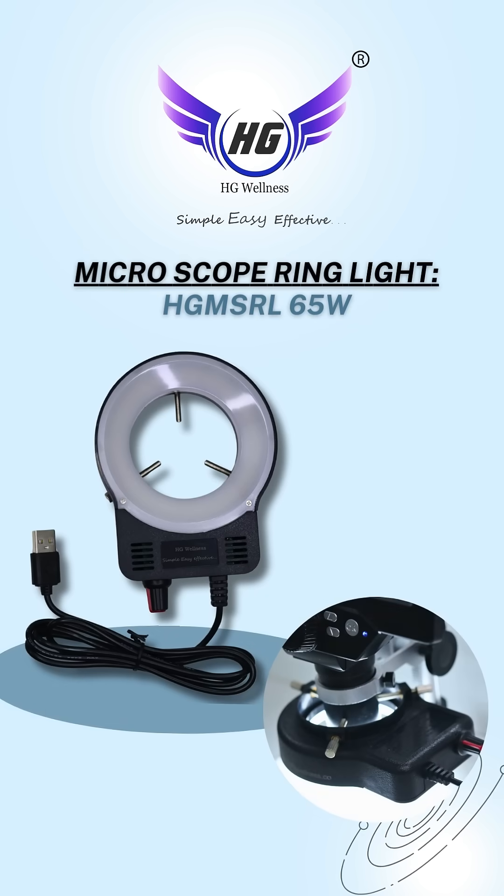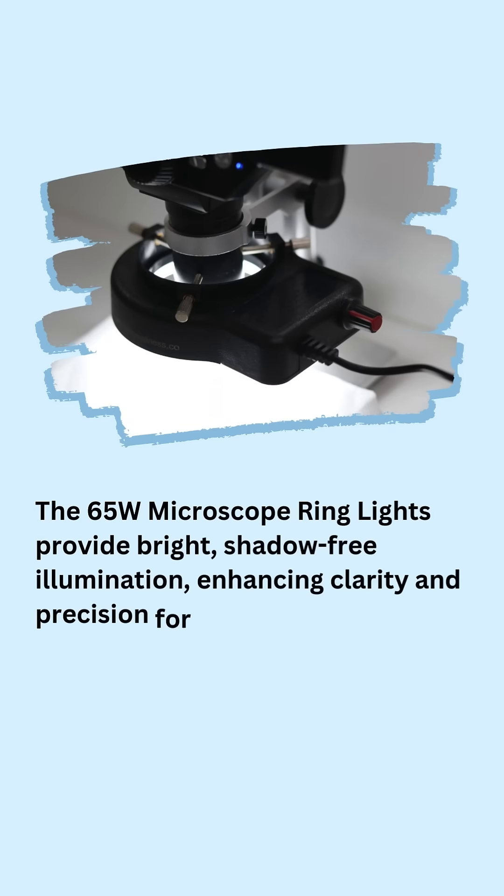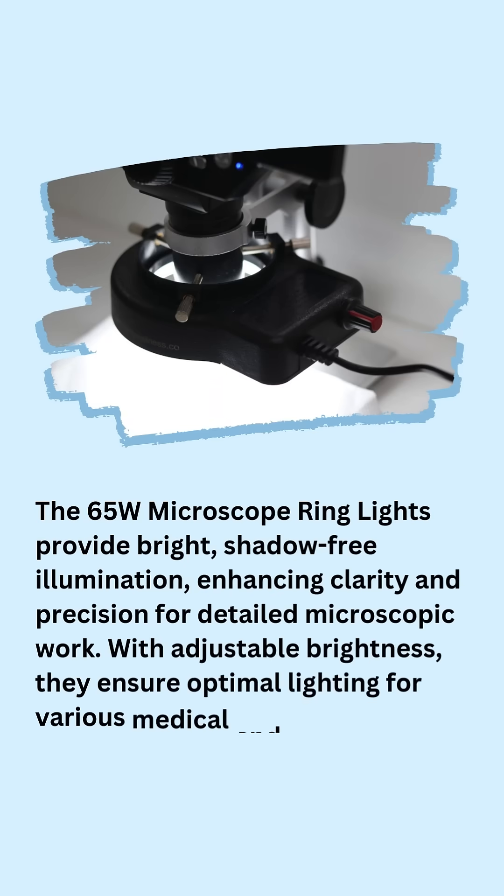Microscope Ring Light 65W. The 65W Microscope Ring Lights provide bright, shadow-free illumination, enhancing clarity and precision for detailed microscopic work. With adjustable brightness, they ensure optimal lighting for various medical and laboratory applications.